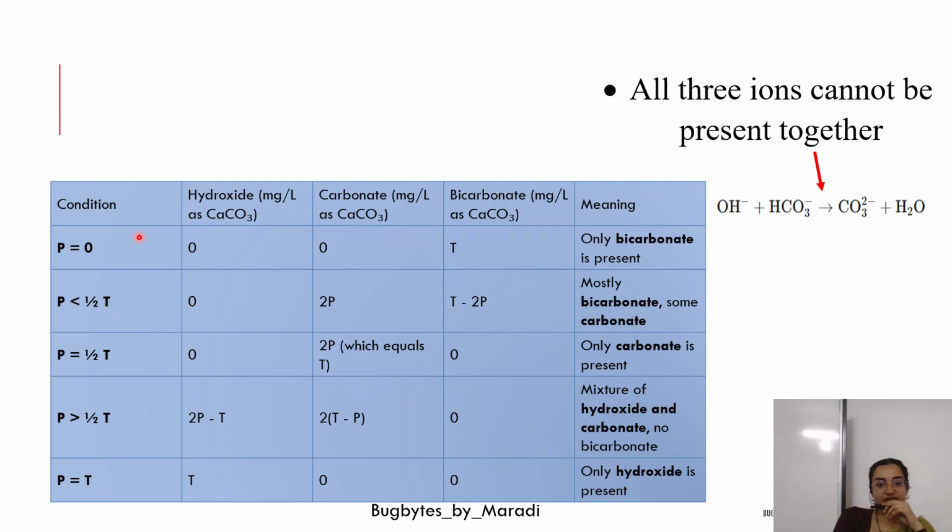So in this, there are different conditions or different cases. Before that, I'll just tell you, for low to neutral pH, somewhat like 6 to 8.3 or 4 to 8.3, mainly bicarbonates will be present in this particular water sample. Hydroxide as well as carbonates are usually low or absent if it is less than 8.3. That we have already discussed.